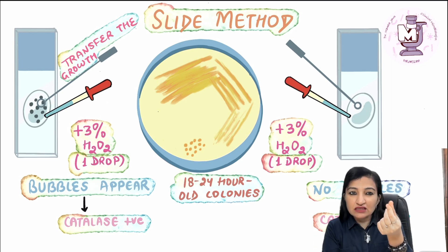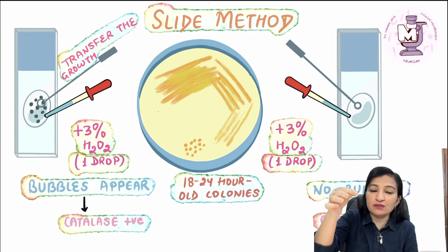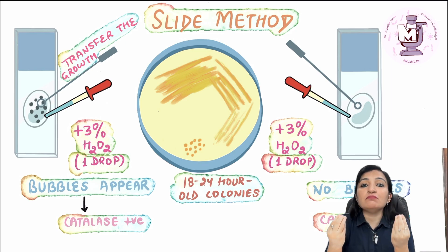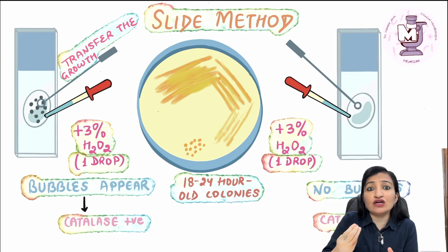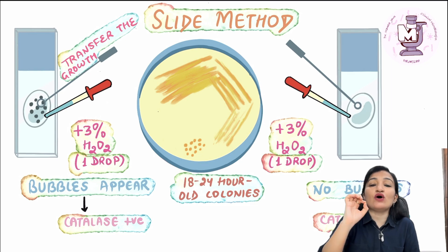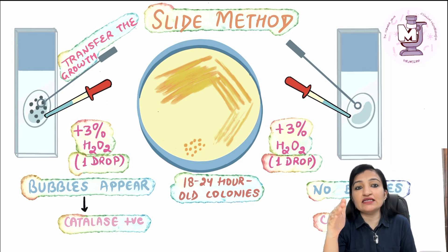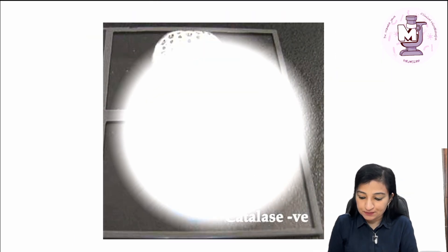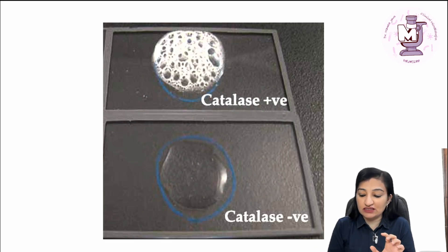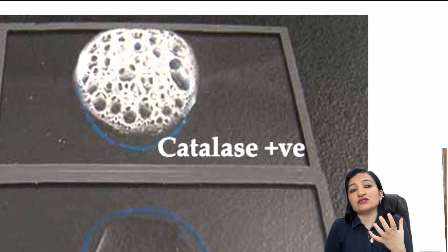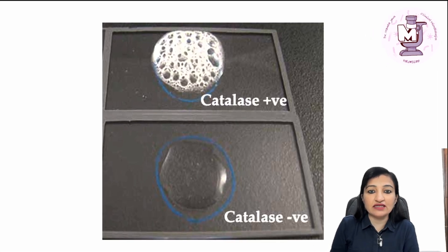Do not mix the growth with the 3% H2O2 you are adding — simply drop one drop and look for bubbles. The bubbles appear immediately. If bubbles appear late, say after 20 to 30 seconds, we do not call it a positive catalase test, because certain organisms have enzymes other than catalase that can also break down H2O2. Late appearance of bubbles is not considered a positive test. This is how the actual test looks: bubbles appear in a positive slide catalase test, while the negative test shows no bubbles.